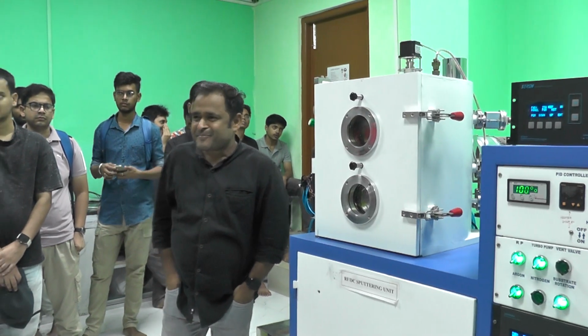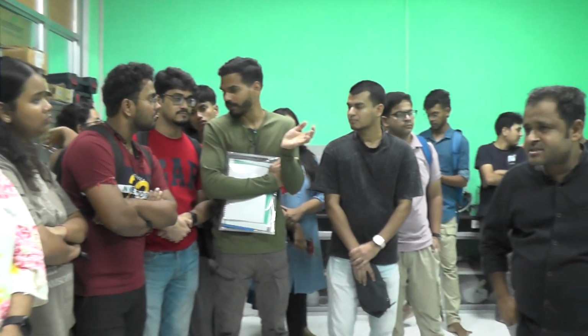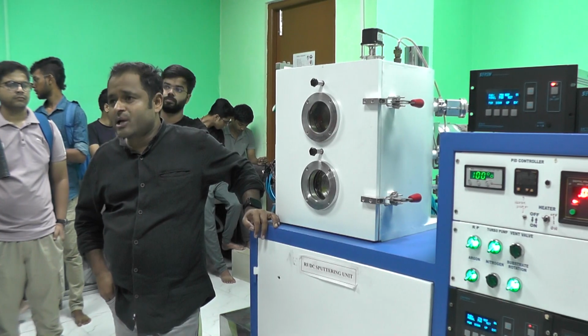Anything? So you were saying, how does it depend on the deposition rate? Actually, we have calibrated our machines by XRR, by ellipsometry, by profilometry.